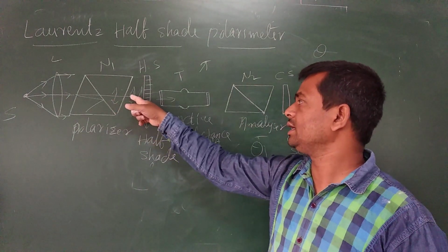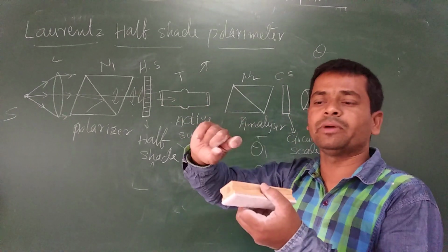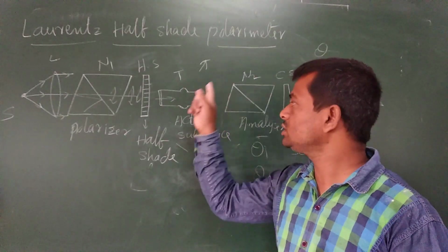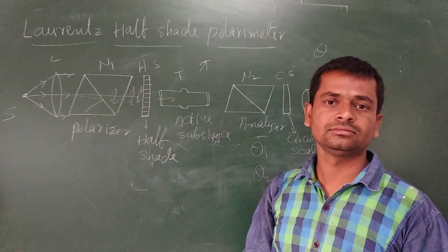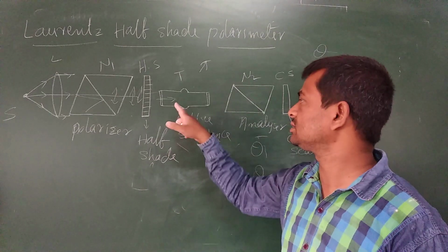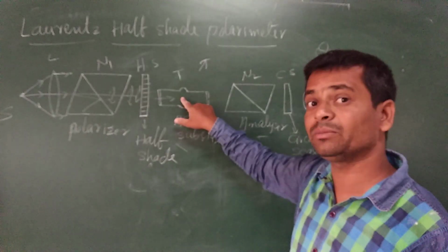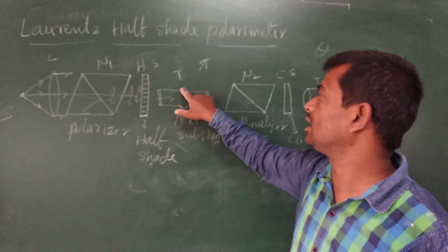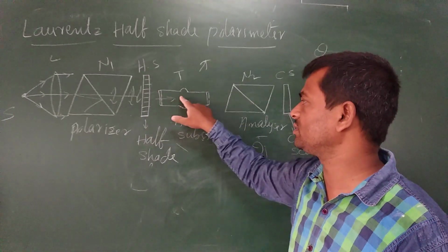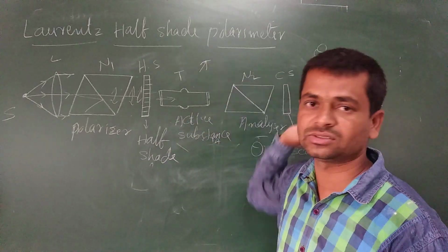Then the light which is coming here, if it is traveling through the air bubbles, cannot make the vibrations rotate. Only the solution can make the rotations. So then we cannot get the exact answer. If you have to get the exact answer, you must do it like this. Whatever air bubble is present simply goes and fills this gap. This gap cannot disturb the light which is entering into the solution. So that is the reason why this is prepared in this manner.